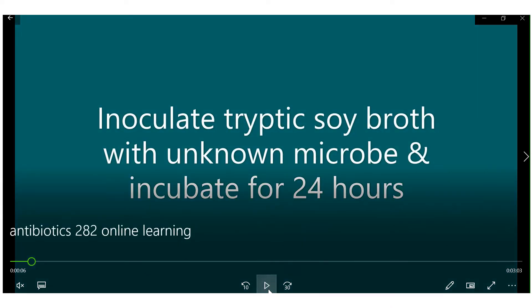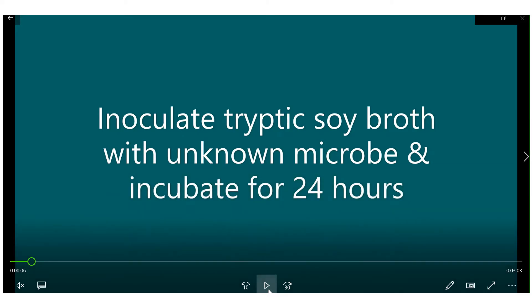The first thing that you want to do for the antibiotics lab is to inoculate a tube of tryptic soy broth with your unknown microbe and incubate it for 24 hours. This will ensure that you have live and active cultures to work with.